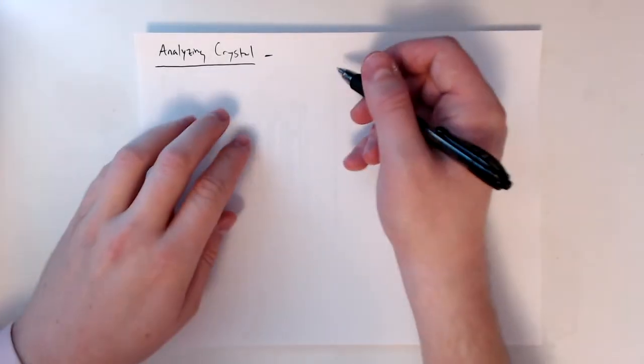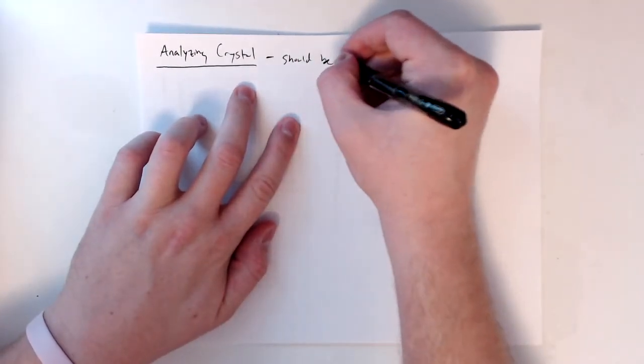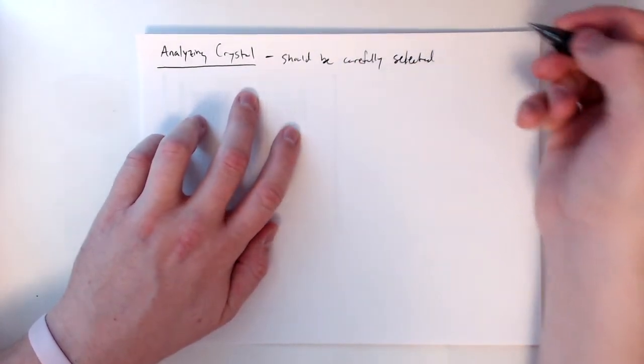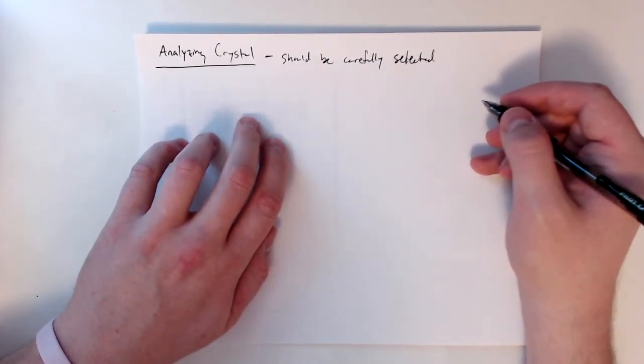All right, so let's talk a little bit more about this analyzing or analyzer crystal. And so this crystal needs to be carefully selected because it affects the range of detectable atomic numbers that we can detect.